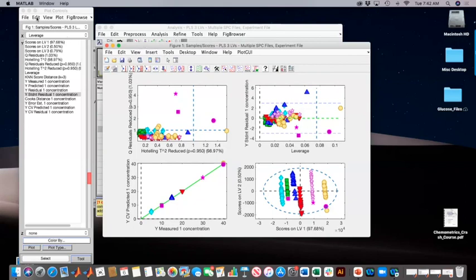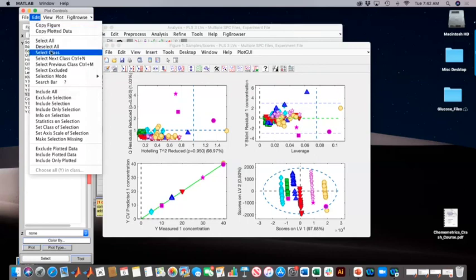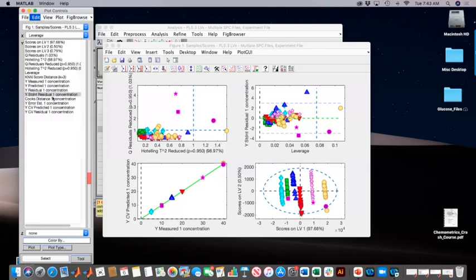I'm going to say exclude those. One of the things that I know here is I've got plenty of data, and for every single instance of concentration, I've got 20 samples of it. So leaving a few out isn't going to bother me. I don't really believe they have essential information in them. So I'm going to exclude those.